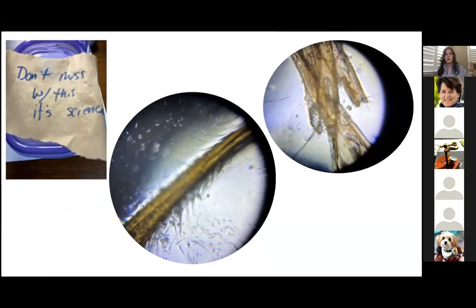So I got a mosquito. I had saved a mosquito. I put it in my refrigerator, and I didn't want my family to accidentally think it was something that they should, well, of course they probably wouldn't because it kind of looked gross in there, but in a little container, because I wasn't quite sure how to preserve the mosquito. And I might have waited too long because my mosquito pictures really aren't that good, but there are lots of really good mosquito pictures out there. So this is one area I'm still working on, getting better mosquito images that I Foldscope myself.